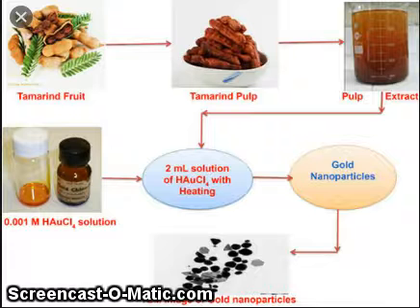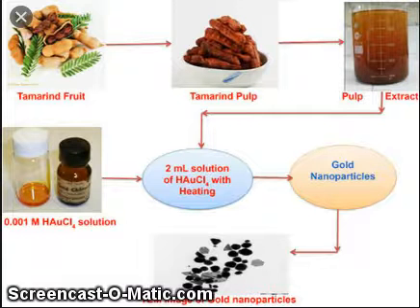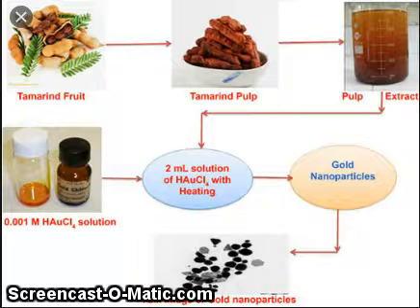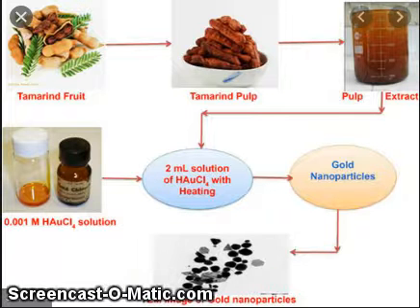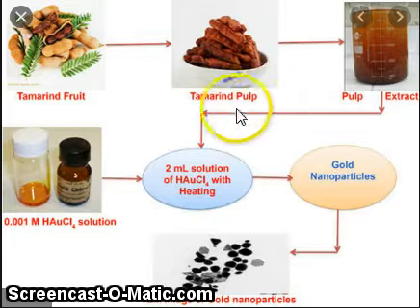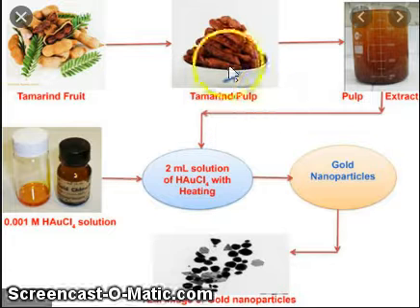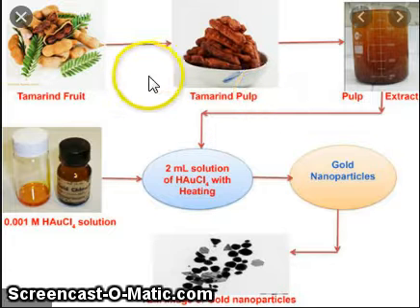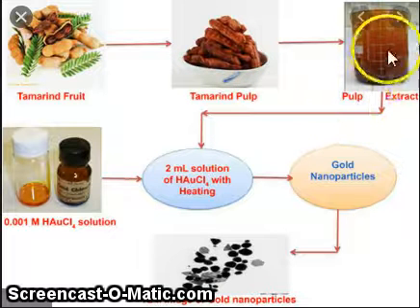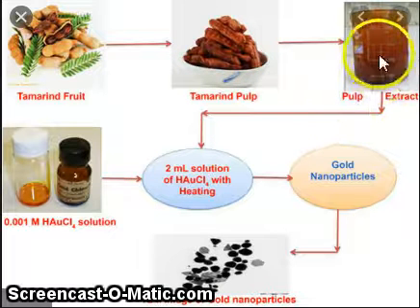This is the green synthesis. You can see here this is tamarind fruit — you all know tamarind fruit. This is the tamarind pulp, and then this pulp plus extract.